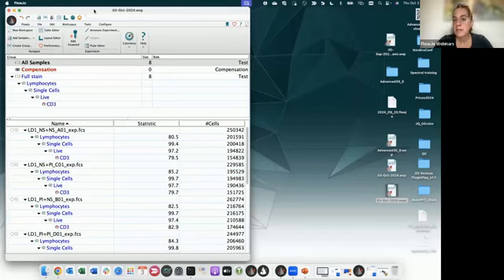by using high-dimensional analysis. Now, I don't know if you are familiar with it, but in the latest, let's say, couple of years, people are analyzing their data by using algorithms rather than manual gating analysis or manual gating strategy. And honestly, I'm really happy with that because myself, I'm so tired of making manual gates. So I really appreciate that.